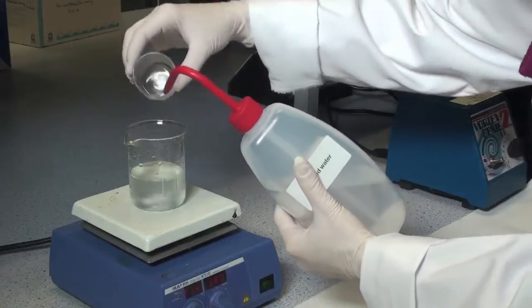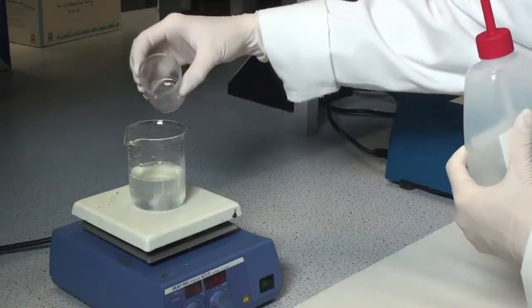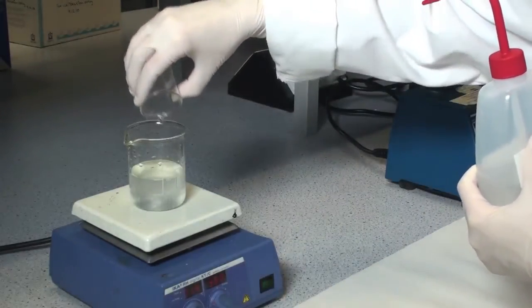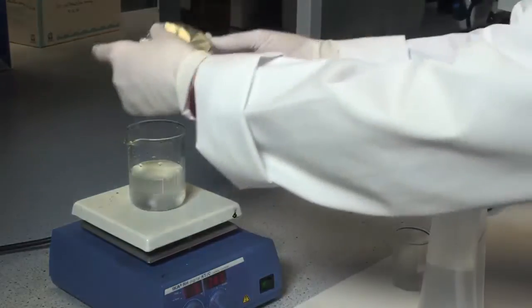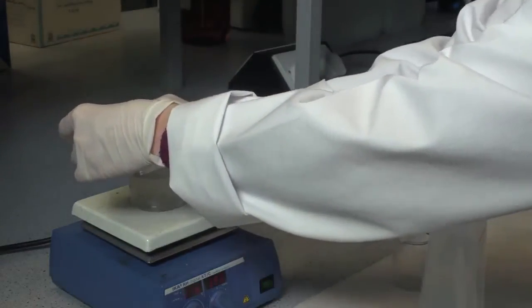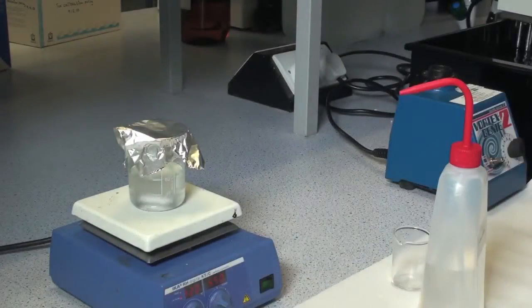Use a minimum volume of water to rinse out the beaker and add this to the stirring starch solution. Cover the beaker with aluminum foil and allow to stir and heat for approximately 5 minutes until the starch completely dissolves.